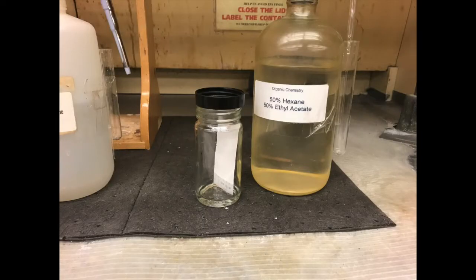So every 15 minutes, we took a small amount of the reaction mixture to try to analyze it by TLC. We put them all in one TLC plate. That way we can show them all to you at once. And then you guys can analyze what was going on throughout the reaction.